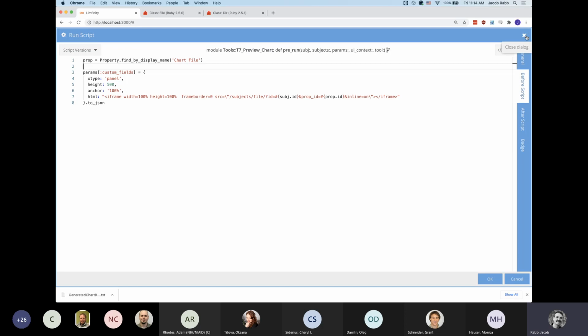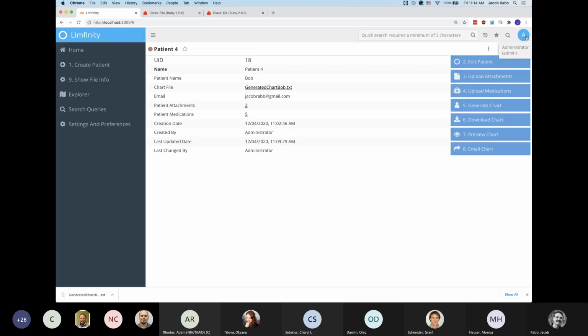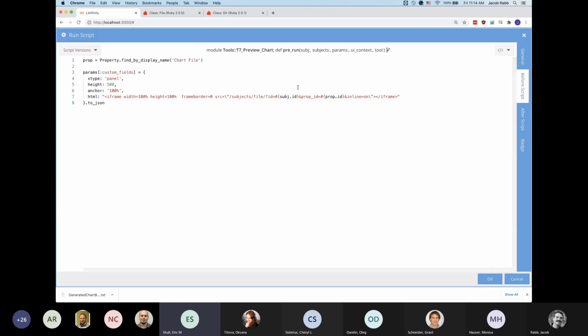All right, any questions on this example? Okay. I have a quick question. Sure. I actually have a use case where I need to render PDFs. Is there anything else I would change there? Looks like you're doing it to JSON or something, but.